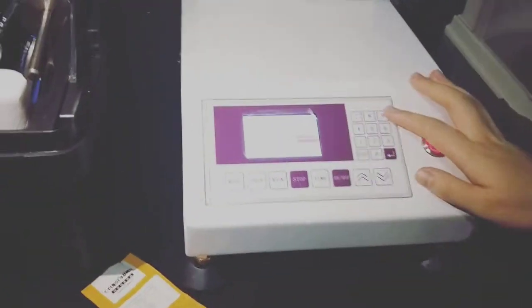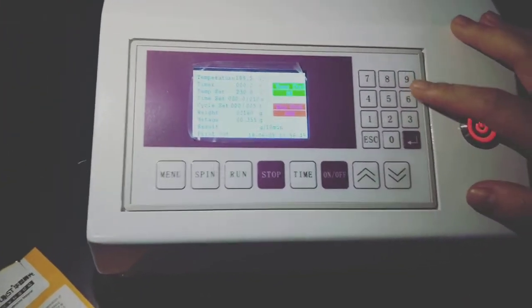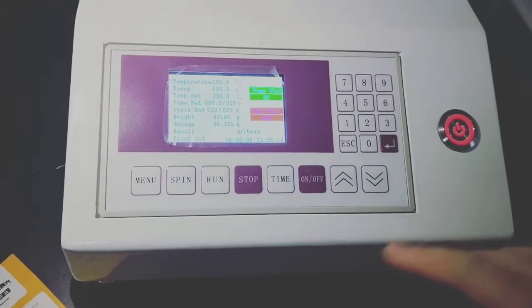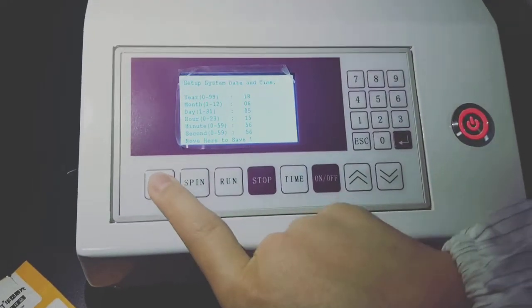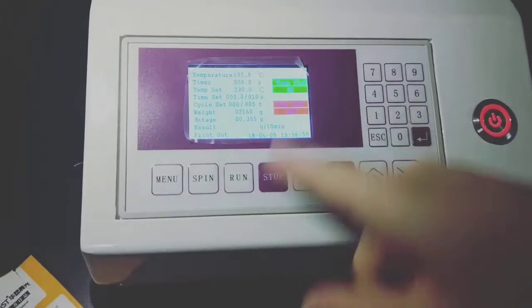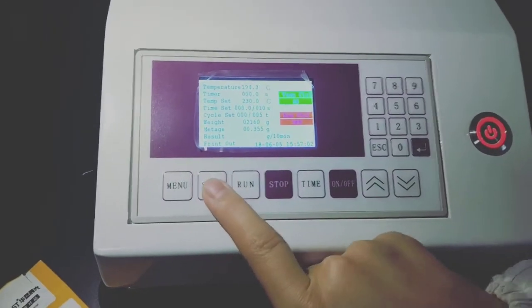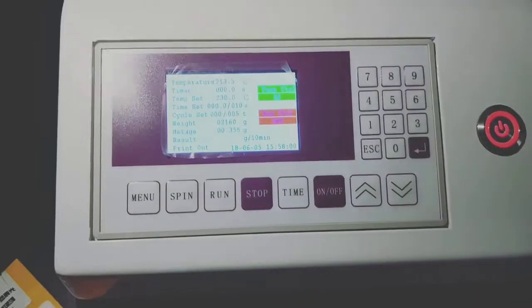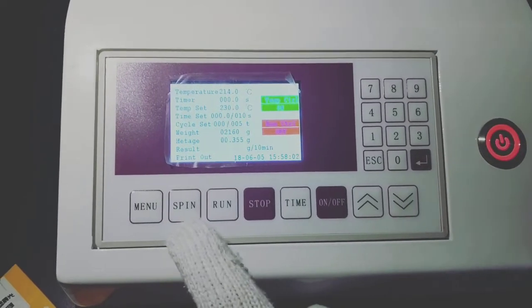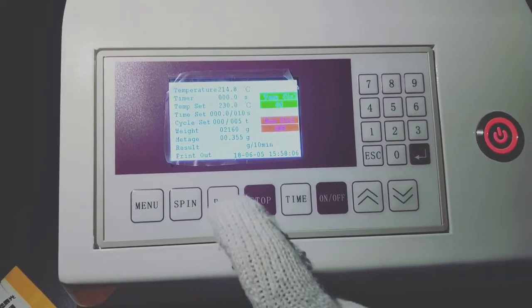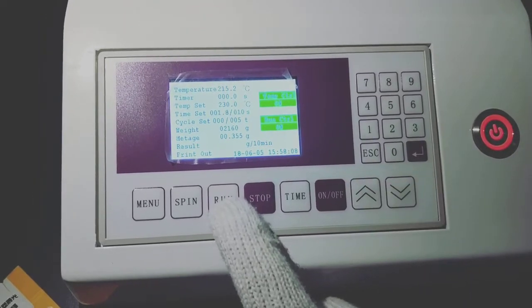There are ten number keys used for inputting the temperature or other values as needed. This is the main manual key. We can set the parameters. This one is used for manually cutting. This spine key is the manually cutting key. And this run key is used for automatic cutting control.